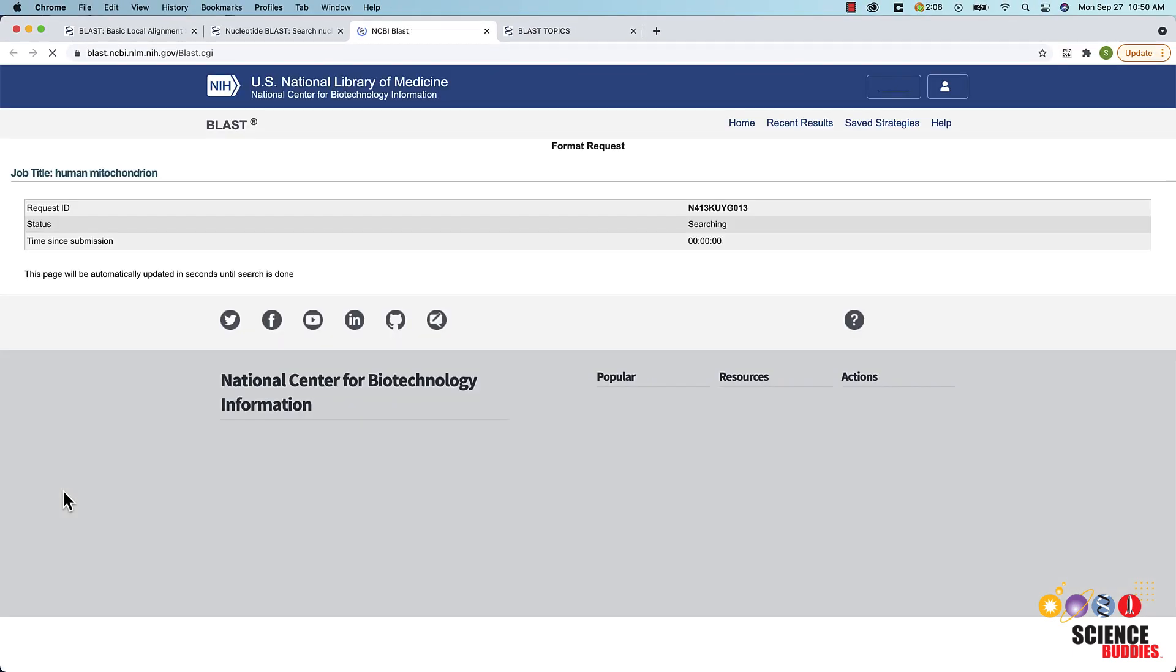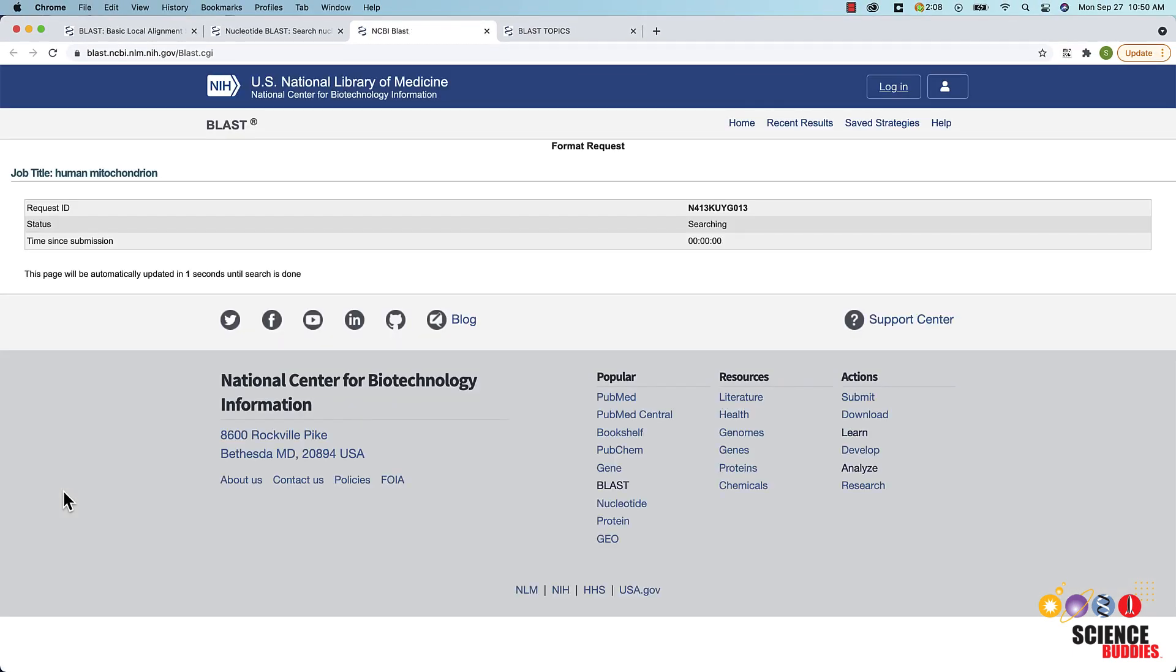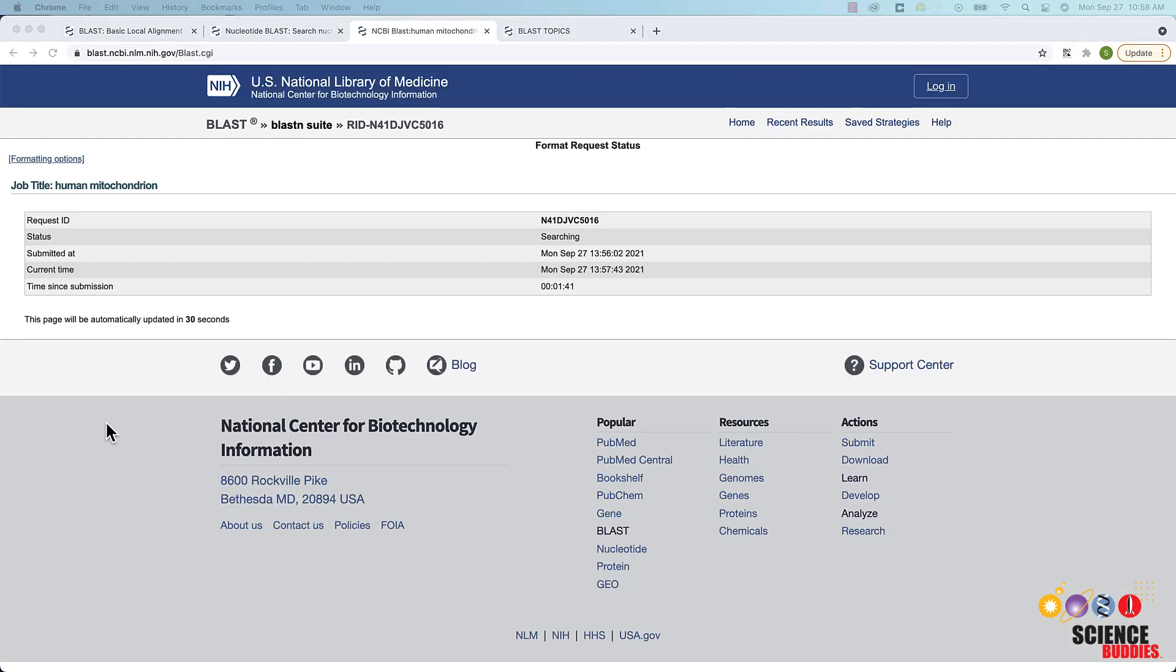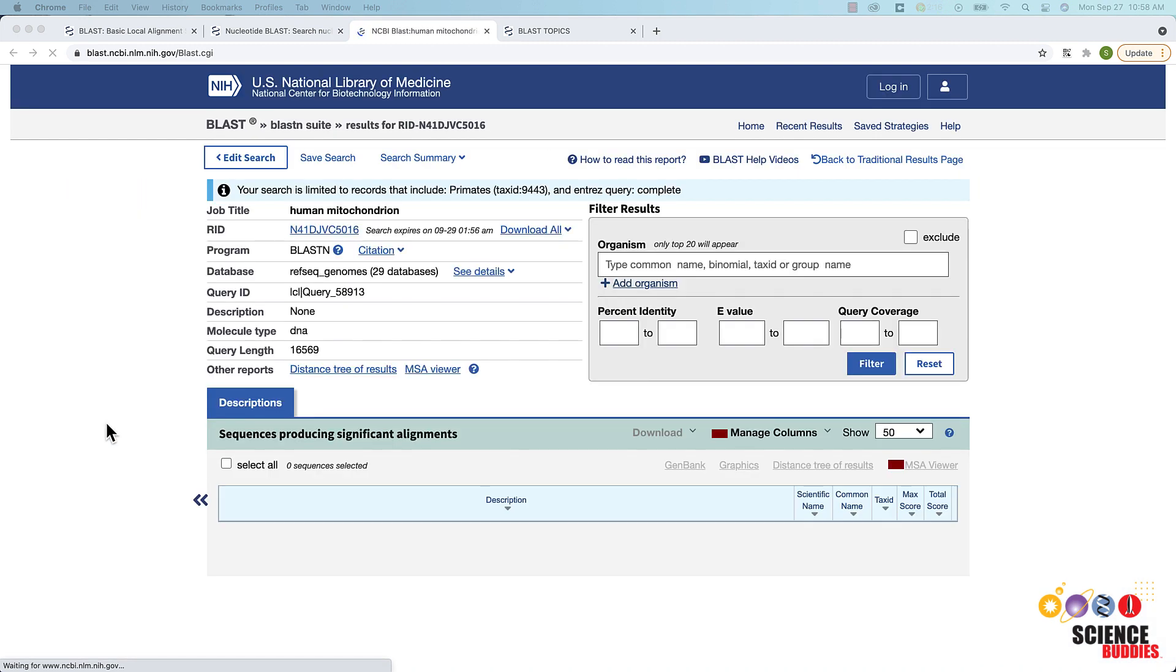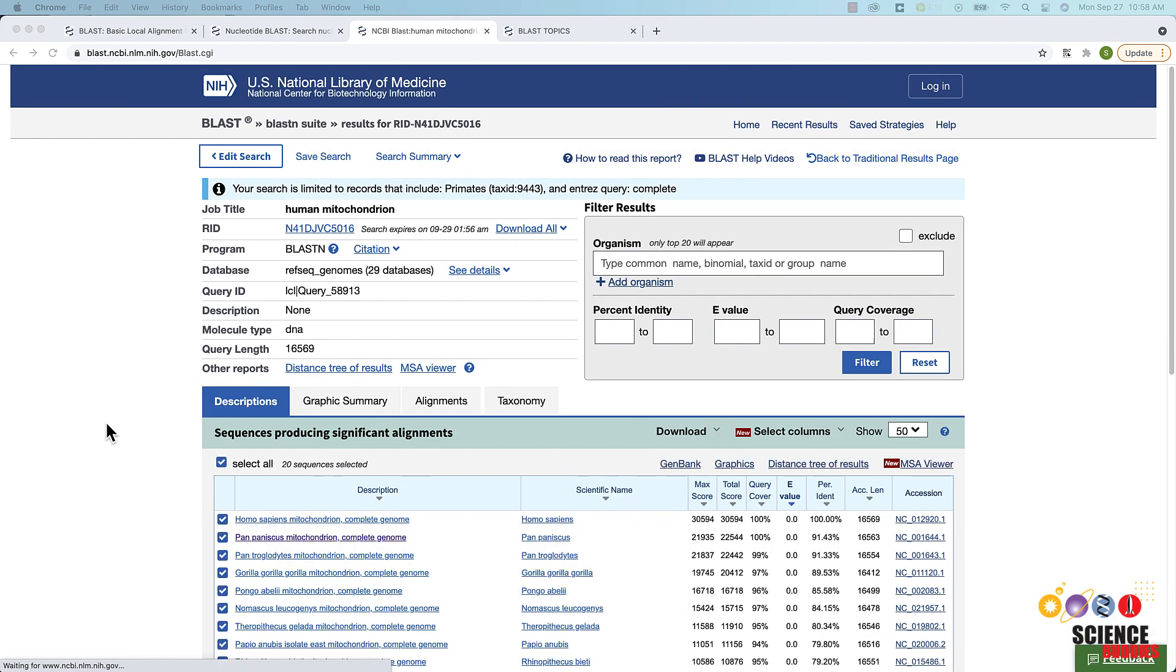It usually takes a while for BLAST to process your query. Once the search is complete, a new web page will appear with your BLAST report.